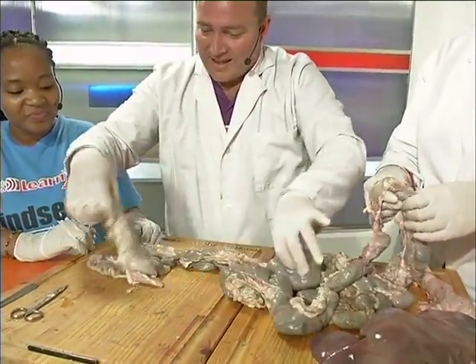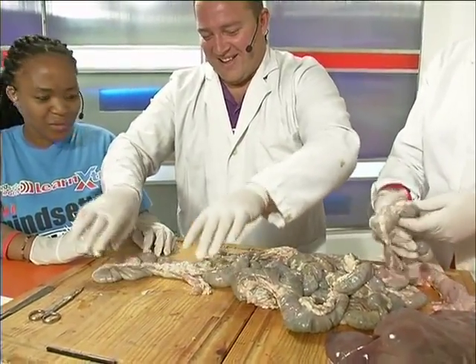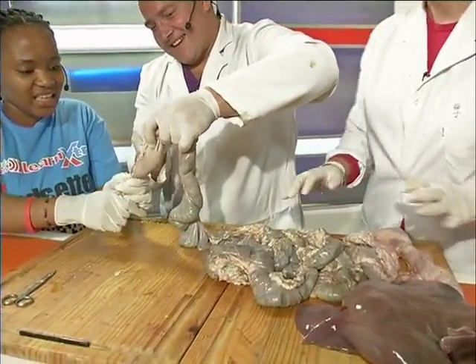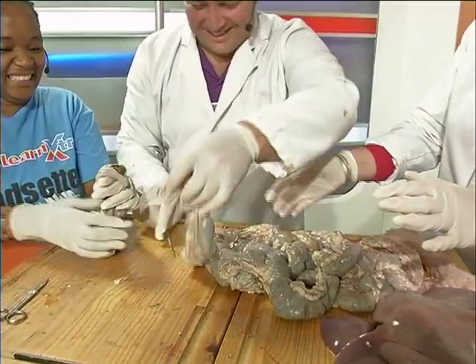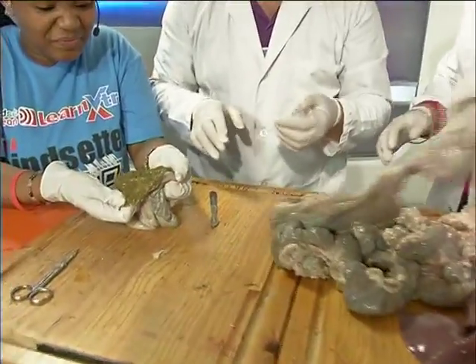Now, in the beginning, this piggy didn't go to the bathroom. I'm sure it didn't. You ready, my girl? You can feel them here. Okay, hold the bottom piece. Okay. Let's cut. Oh, yes, baby. Now, look how green it is. Now we're starting to look at feces.